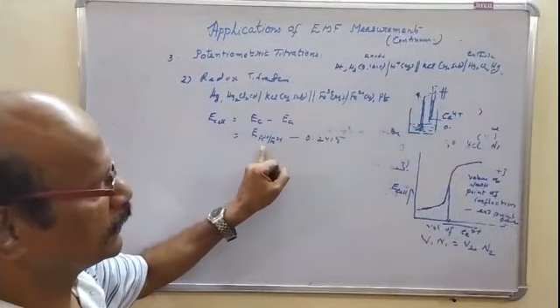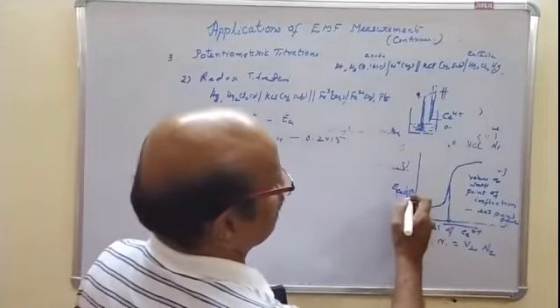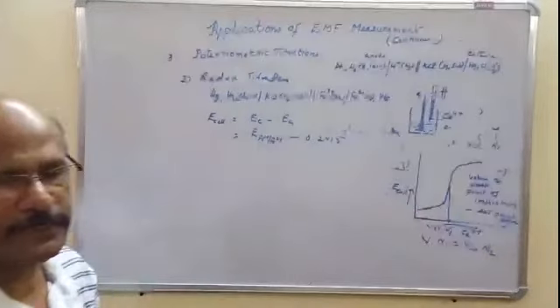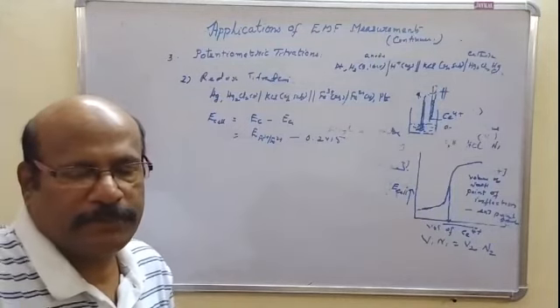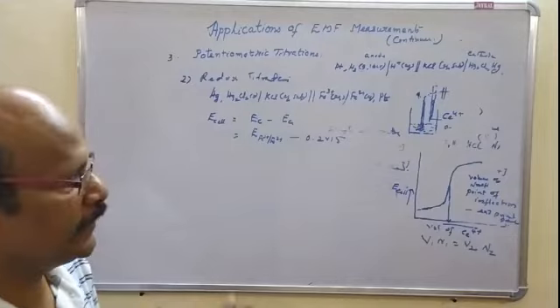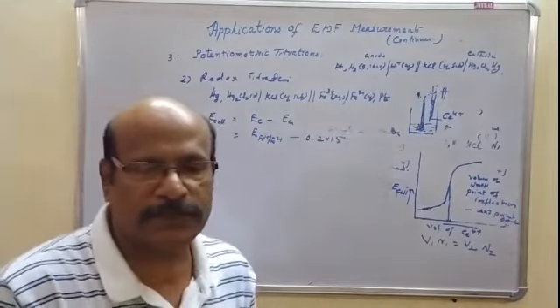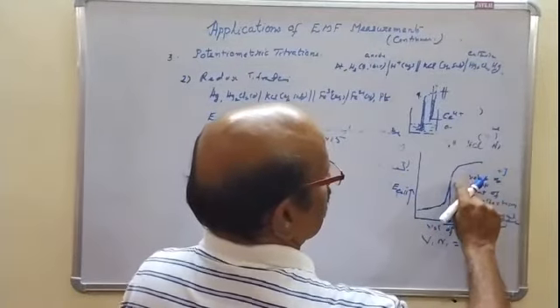So on adding titrant into ferrous ammonium sulfate, the EMF of the cell goes on increasing, and at the end point, by a small addition of titrant, there is a sudden change in the potential, and this can be monitored.